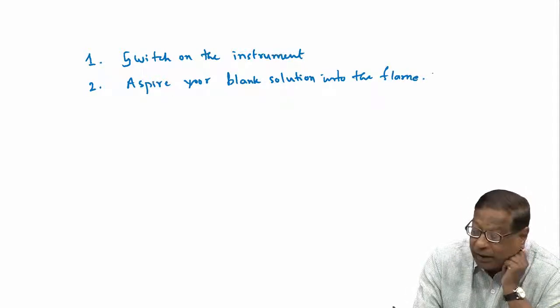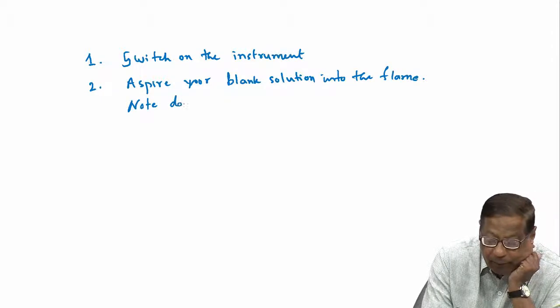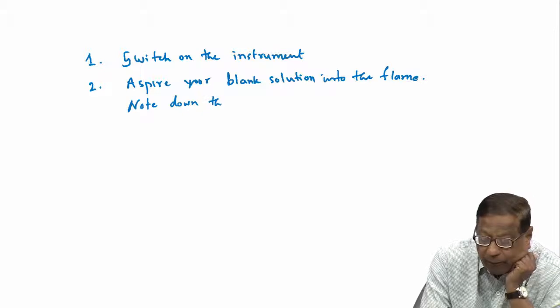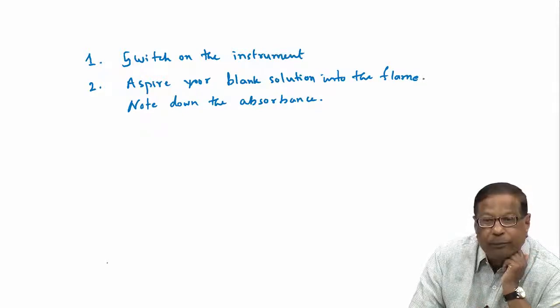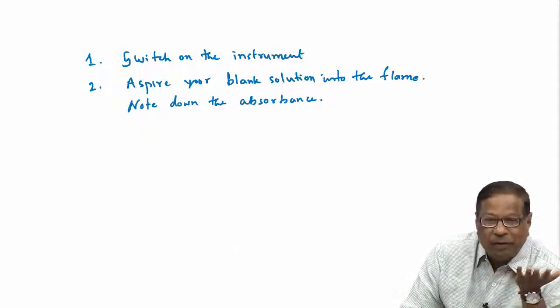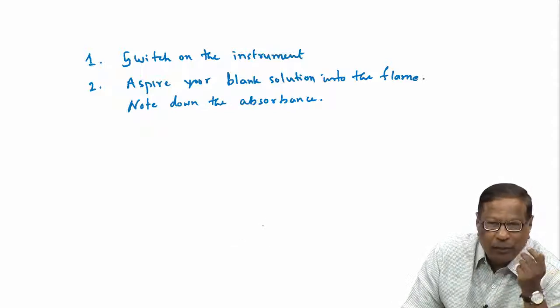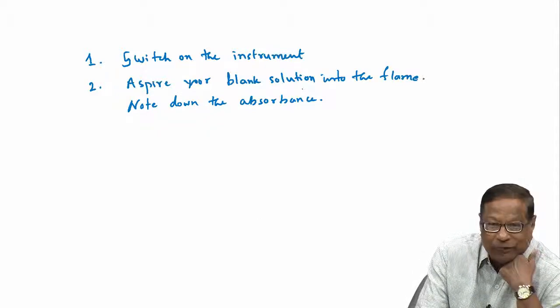Then note down the absorbance. This would be 100% transmittance. That means no absorbance, because there is no analyte element in your blank solution.